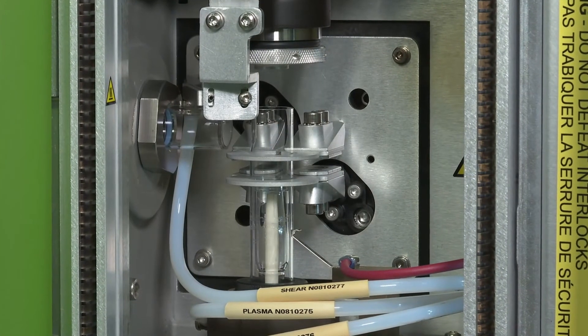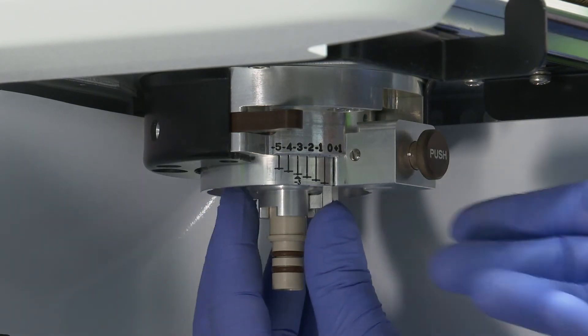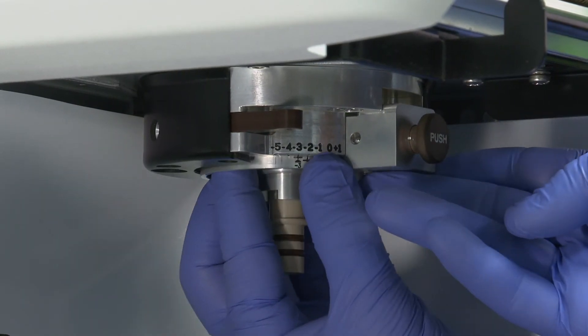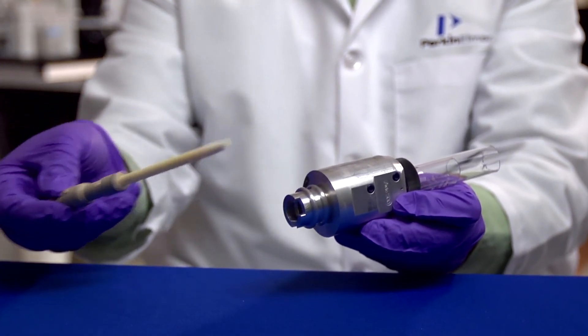One of the most pronounced innovations featured by the Auvio MAX series ICP OES is the flat-plate plasma and ICP torch technology, offering a very low cost of ownership. A robust, proprietary flat-plate plasma technology generates a matrix-tolerant plasma that uses half the argon of competitor systems. Two flat-plate induction fields sit perpendicular to the sample flow, generating a very stable and symmetrical plasma that reduces the need to change coils and cylinders, and no maintenance or cooling is required. The system's vertical torch mount lets you quickly and easily adjust, even while the system is running, for maximum performance with no required maintenance. The removable injector is independent of the torch, reducing maintenance and the potential for breakage.